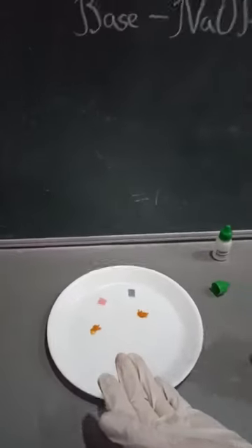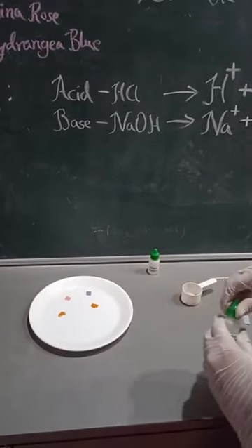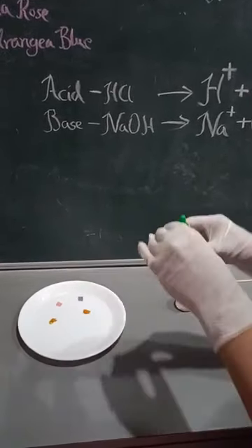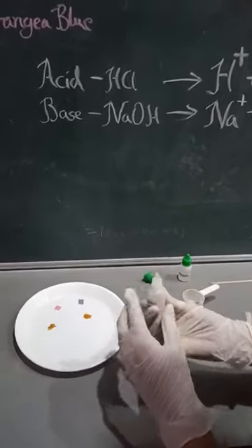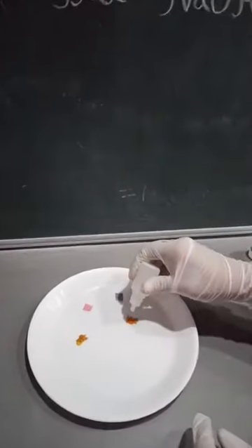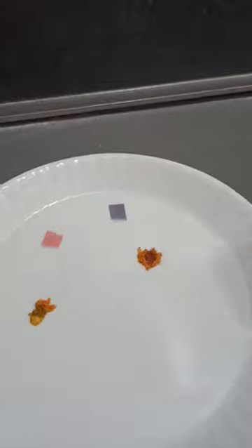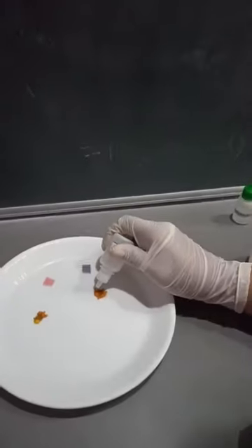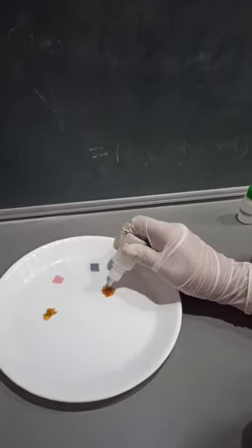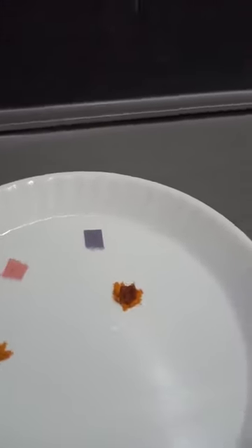As you can see, the color has not changed because it is an acid. But now let's see if the color changes with the base. Oh wow, look at it. It turns into a bright red color. But if you can't see, I will add some more.